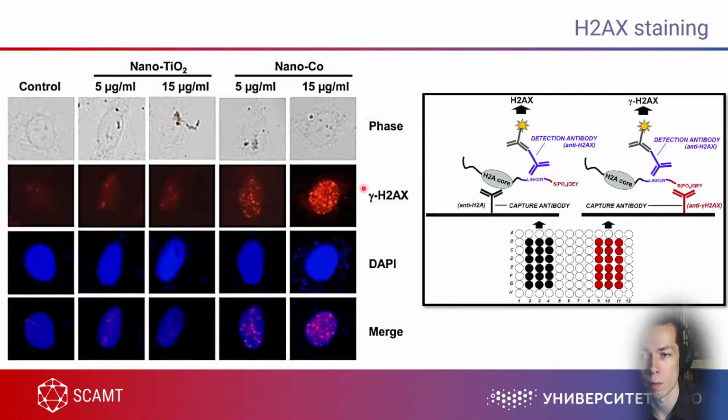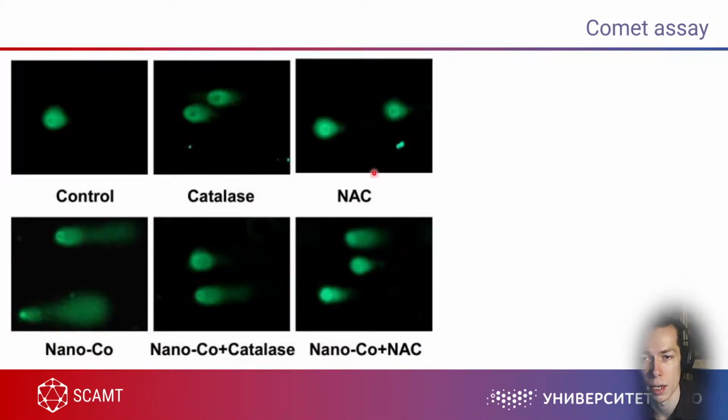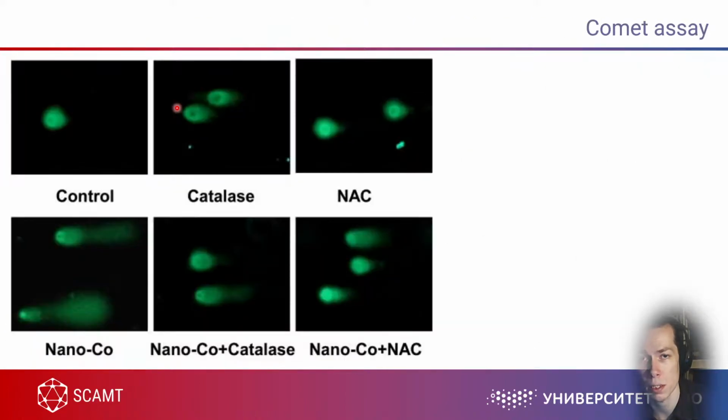So why are these direct ways? Because you directly see with your eyes that this is damage done to histones, so it's damage to DNA. You directly see this is damage done to DNA because of comet tails, and so on. But for example, this was not so direct a way, because you see some decrease, but you don't know why this decrease occurs. And only using some direct ways will you see why this decrease occurs.